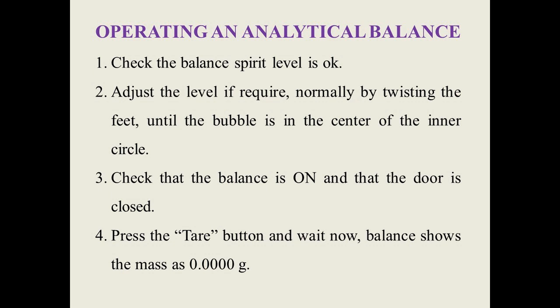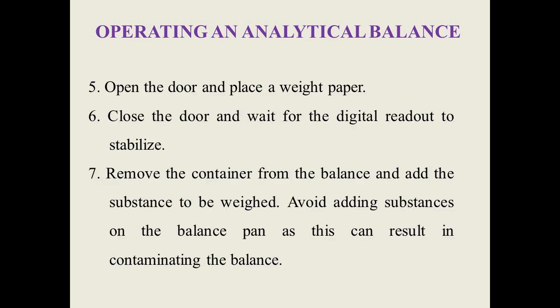Press the tare button and wait. Now the balance shows the mass as 0 grams. Open the door and place a weighing paper or butter paper. Close the door and wait for the digital readout to stabilize. Remove the container from the balance. Add the substance to be weighed.